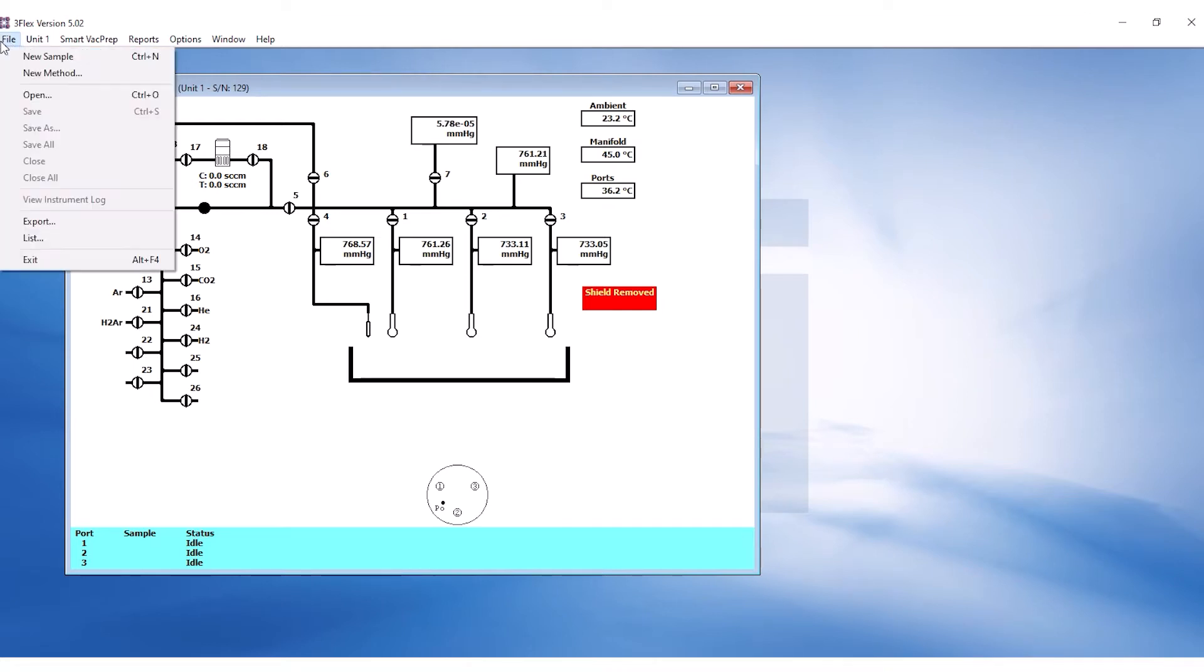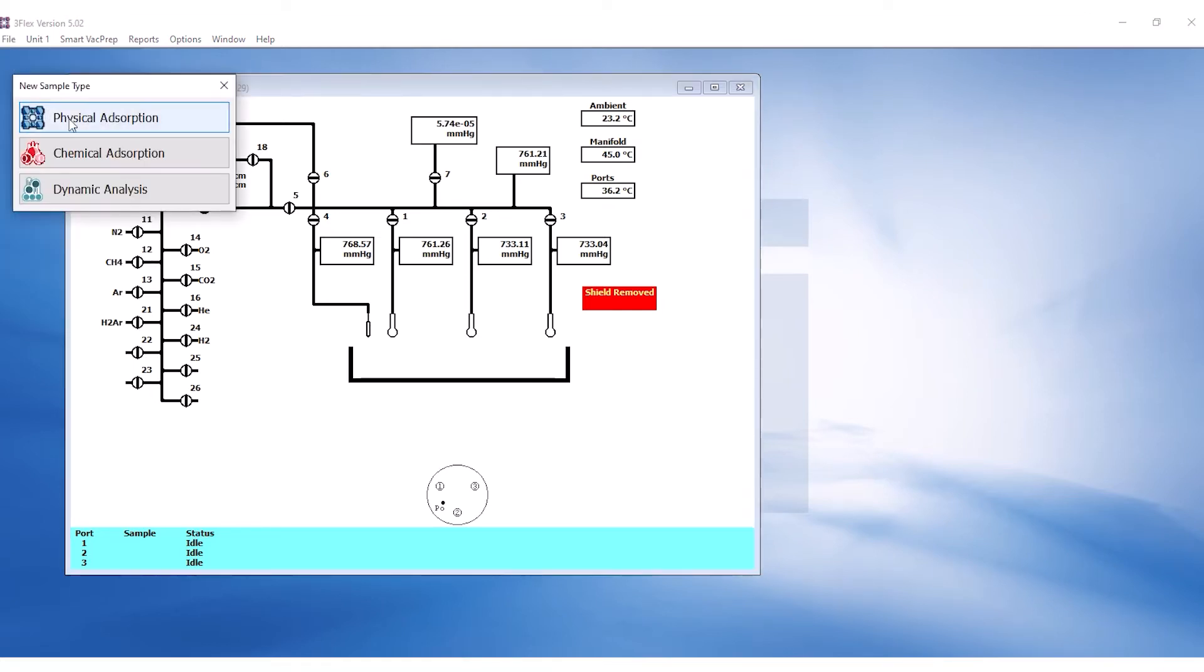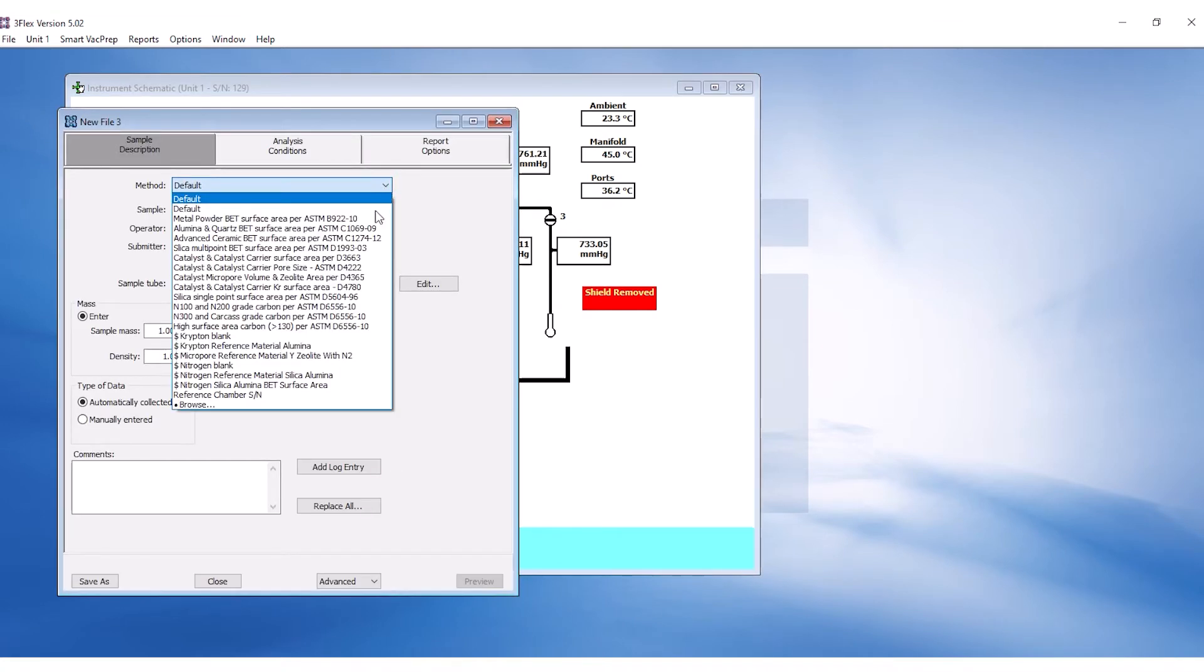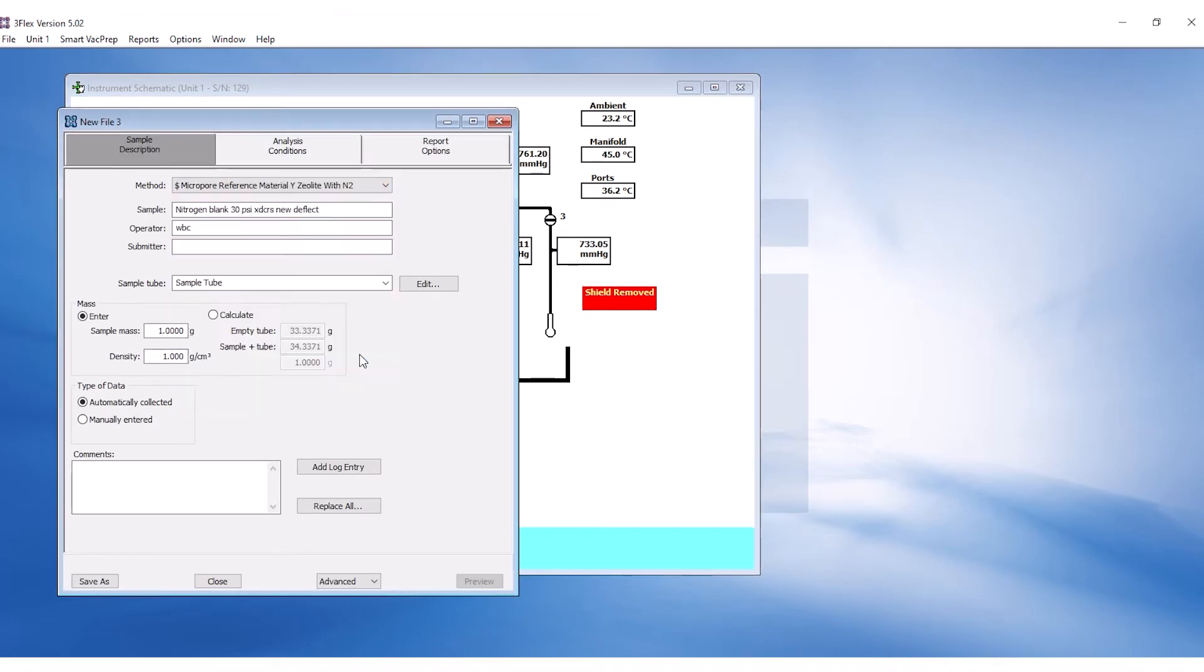Create a new sample file by clicking on File New Sample. Select Physisorption Adsorption for this sample type. Under Sample Description, select the method Micropore Reference Material Y Zeolite with Nitrogen from the drop-down menu. Enter the operator's initials and the masses.